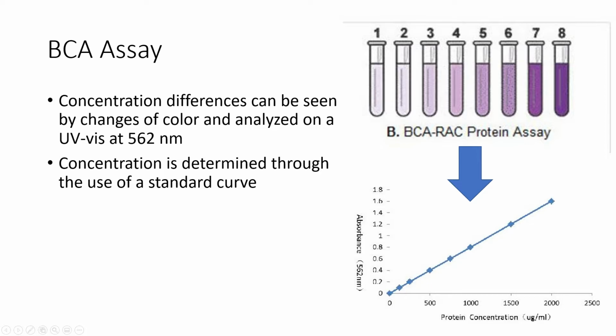So down here you can see what I mean by the standard curve. We generate some linear curve, and once we also have our experimental beta-gal, we should be able to follow this line and determine if, let's say, it gave an absorbance of 0.6, then it should be this point, and that should mean that our beta-gal is about 700 micrograms per ml.